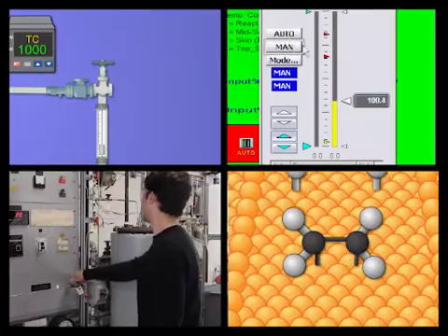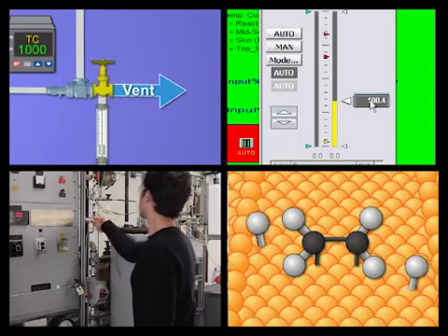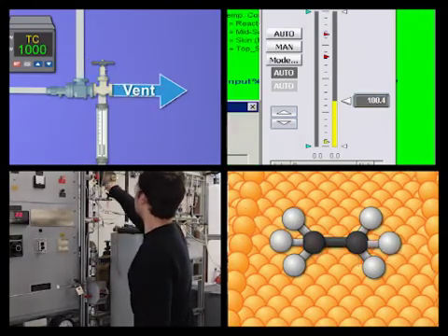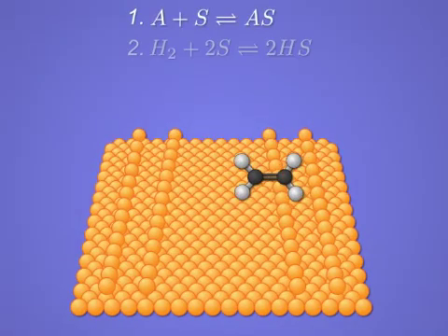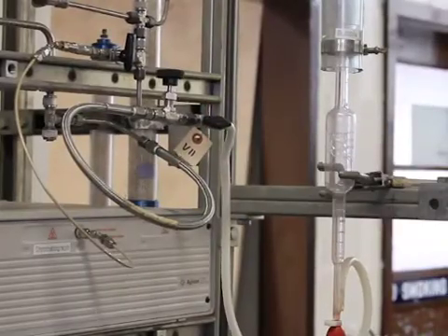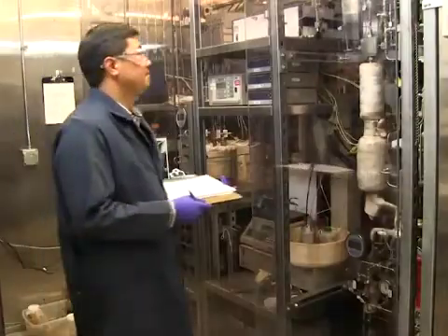You've just watched Jove's introduction to heterogeneous catalyzed reactors. You should now be familiar with the basic mechanism of heterogeneous catalysis, a procedure for operating a pilot-scale reactor, and some applications.